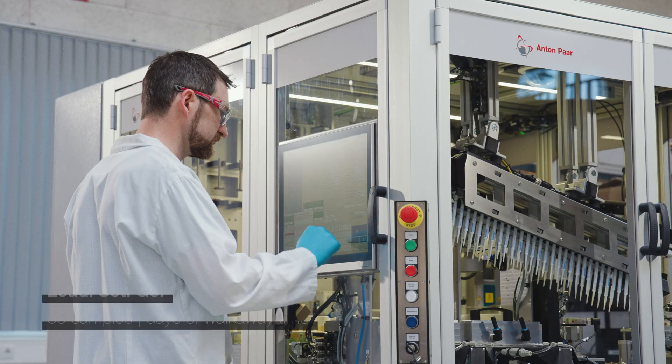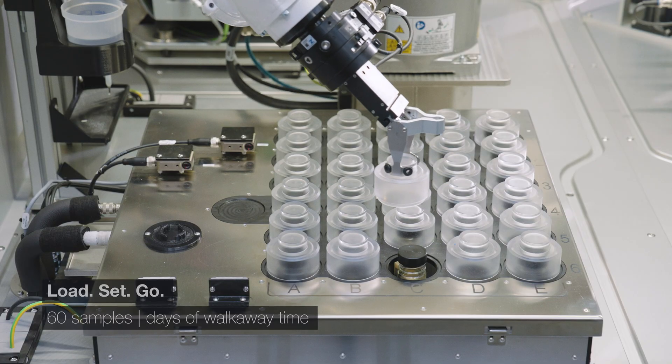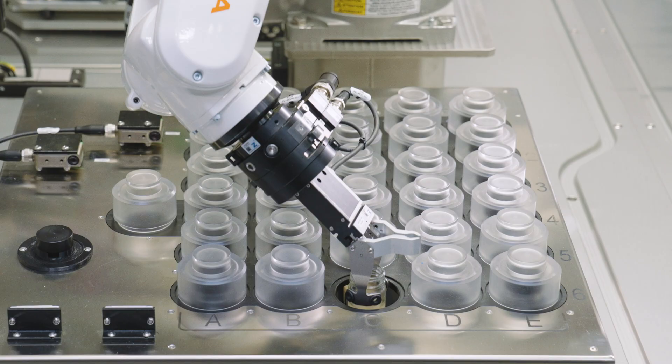Load, set, go. Automate your rheology workflow from sample preparation to cleaning without intervention.